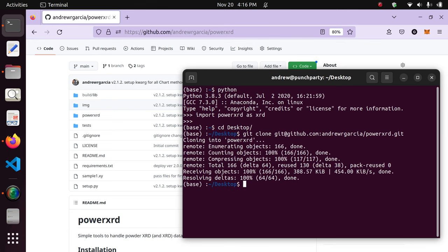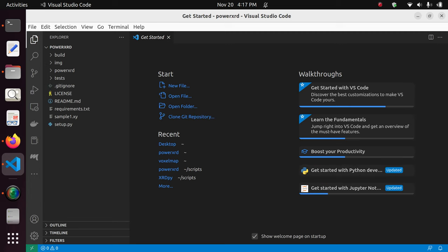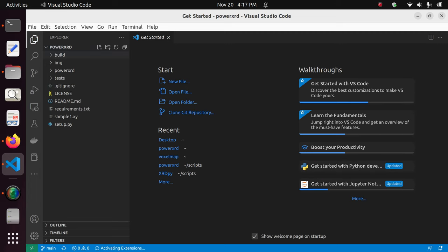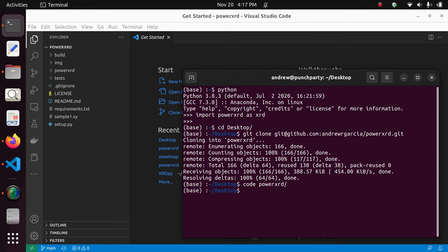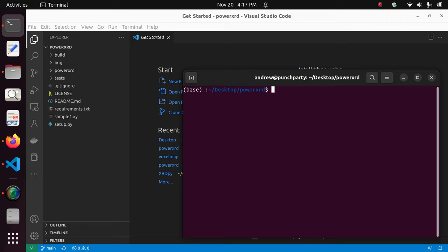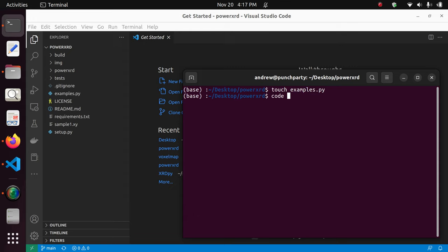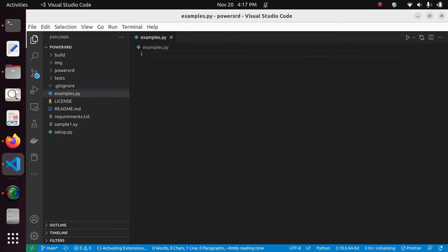After you've cloned it and opened the repository in Visual Studio Code, change directory into the cloned repository. We will be creating a file — I'll call it examples.py. Create it and then open it in Visual Studio Code in the same location. Here I'll be showing you some of the usage of PowerXRD.